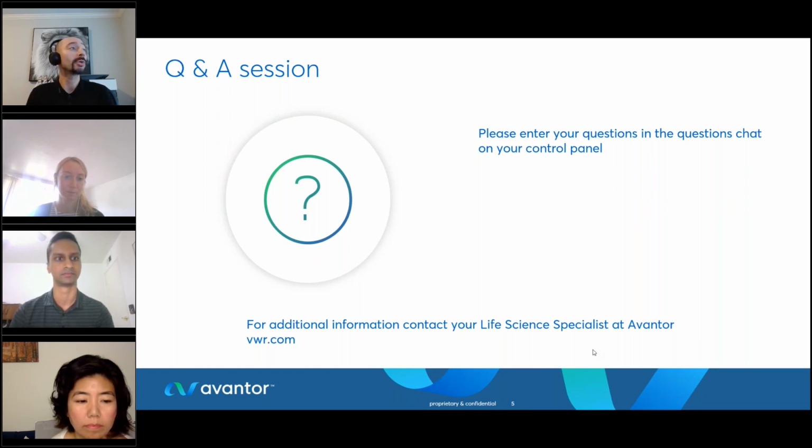Perfect, thank you. And just to add to that question, because of the accuracy and quick turnaround time of whole plasmid sequencing using Nanopore, this is why it has so quickly been adopted by the biopharma and biotech industries, especially for processes such as developing and discovering antibodies or within the cell and gene therapy space. Moving on to the next question.